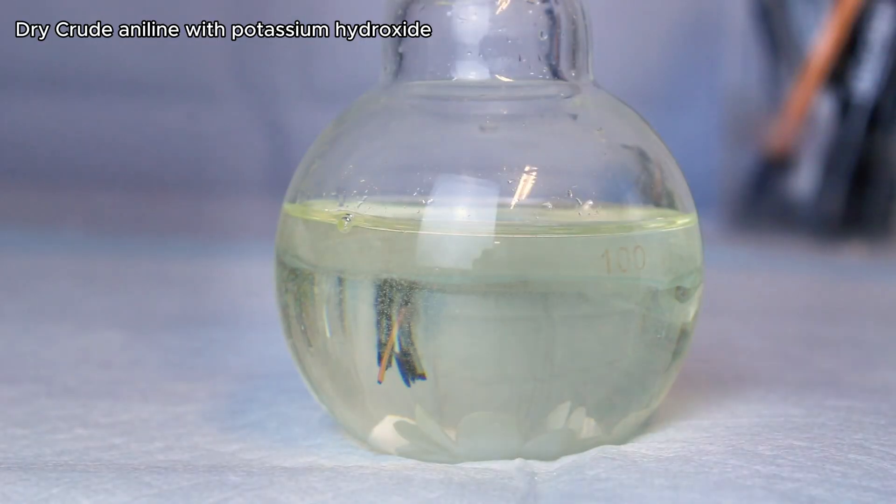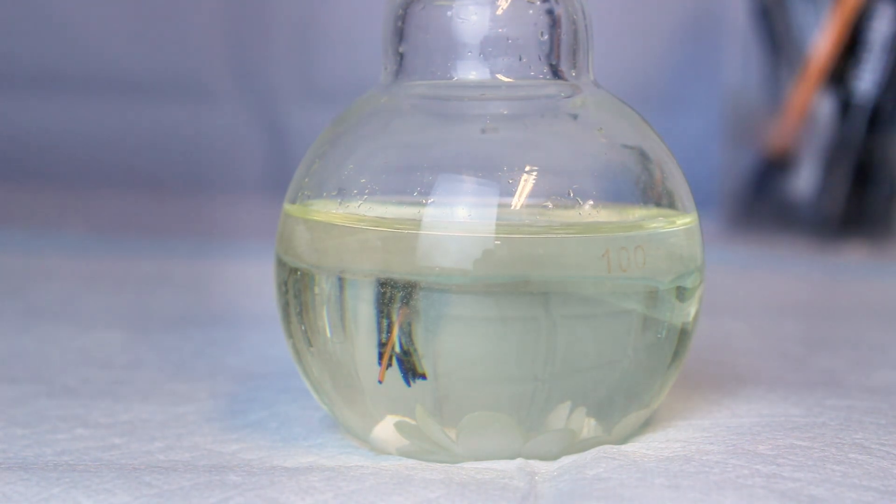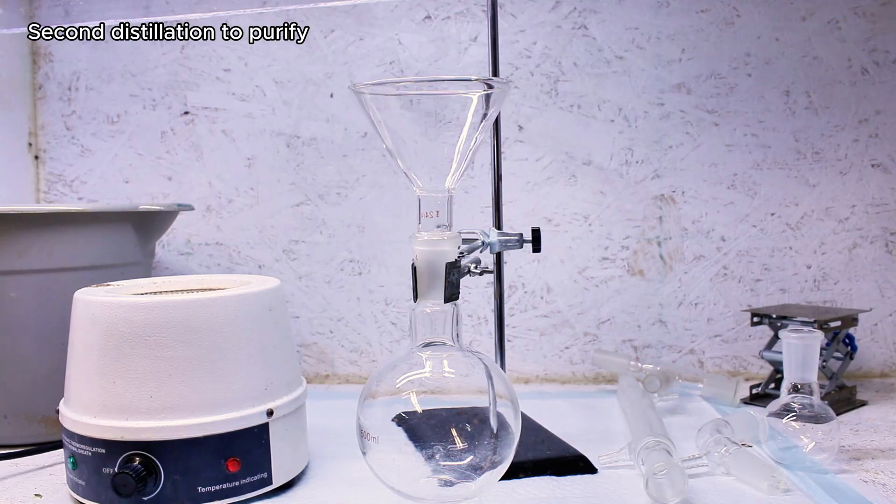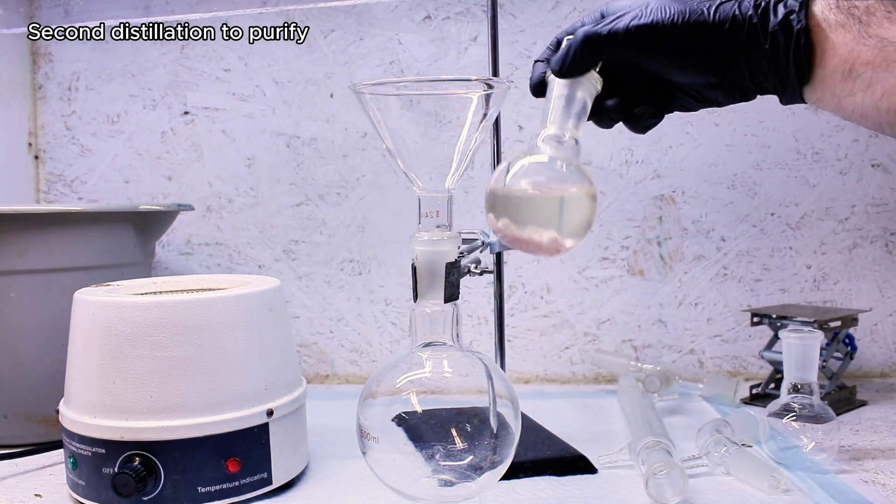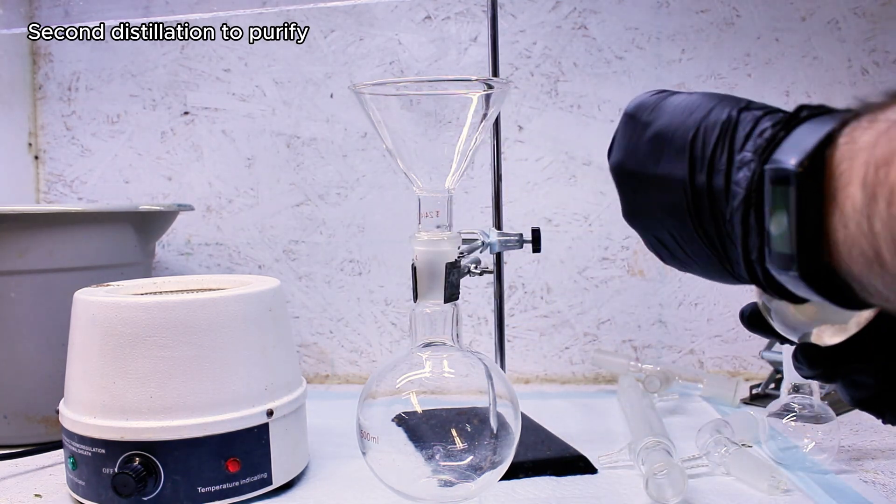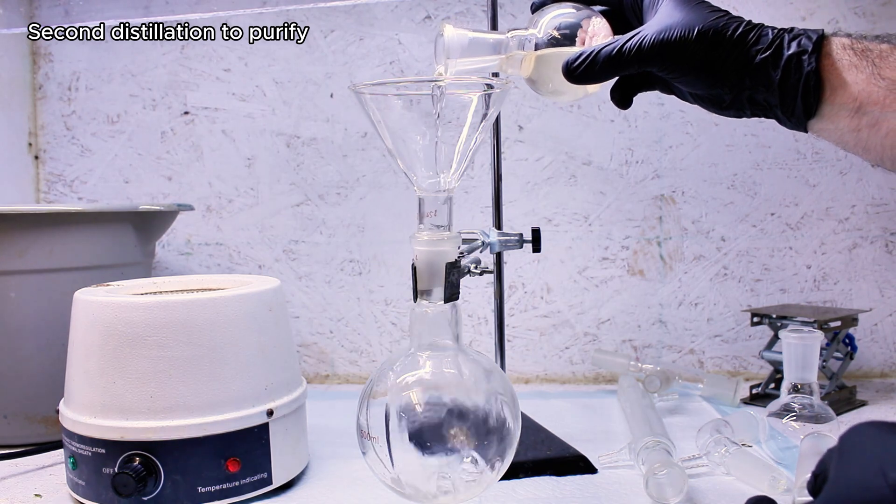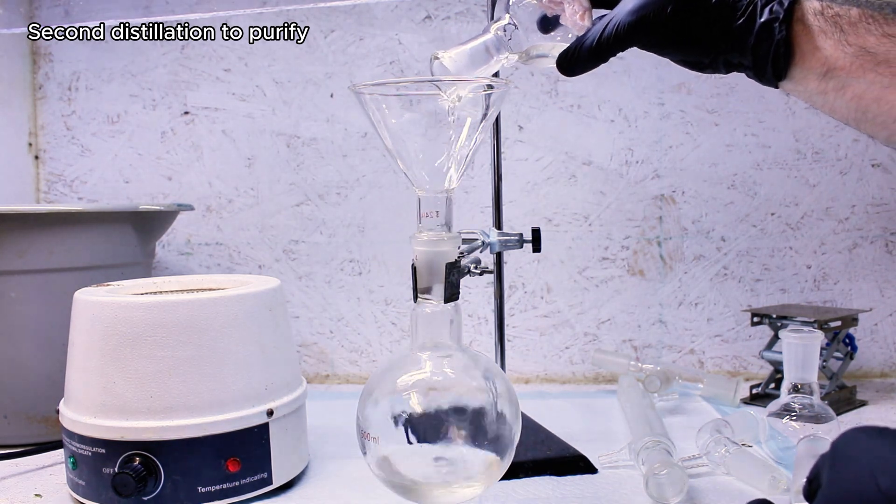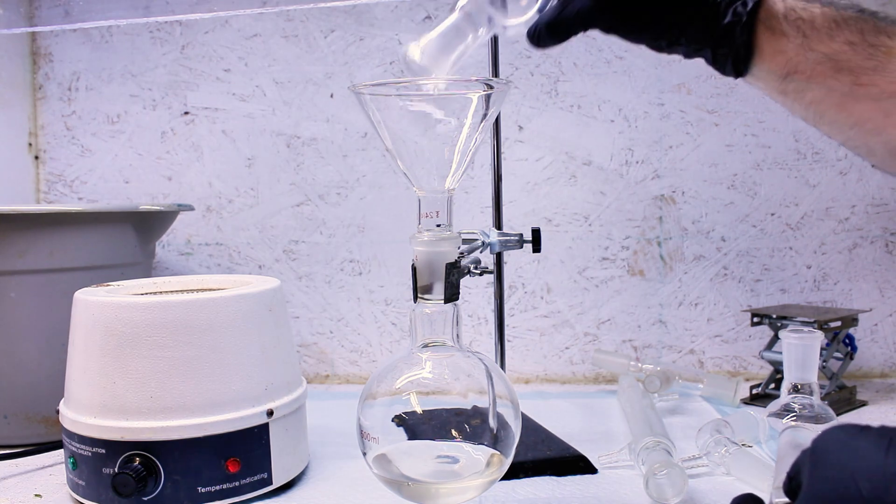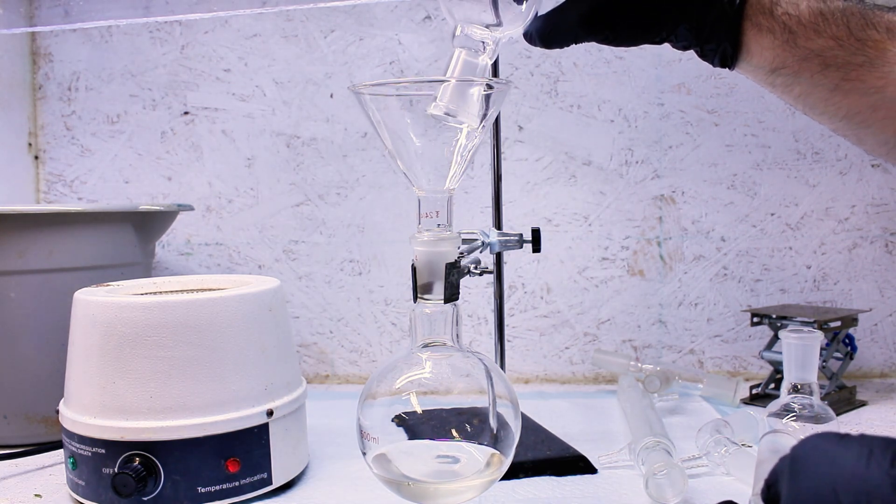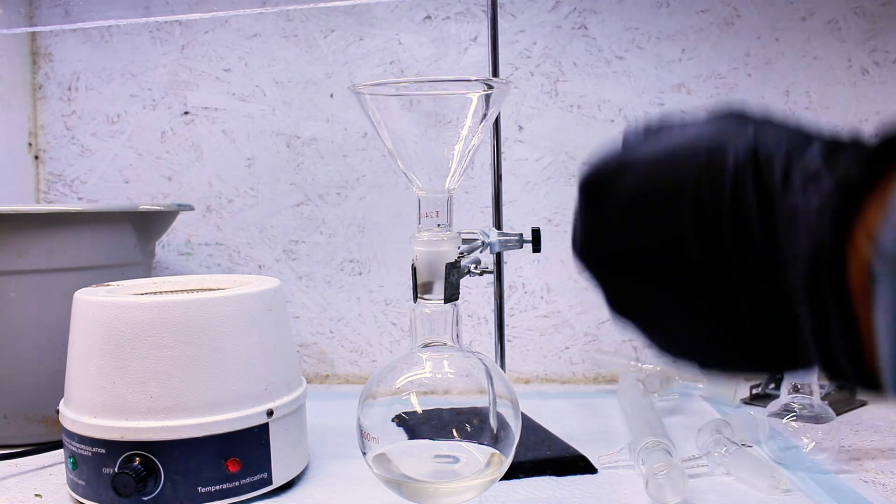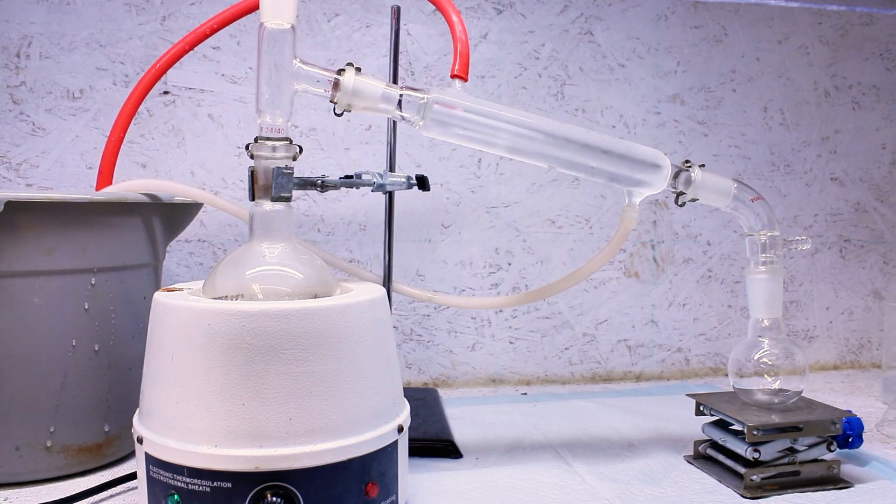When I come back to it the next day, the now much drier aniline is added back to a new boiling flask and set up for another distillation. I crank my heating mantle all the way back up, and the point of this step is to try to further purify my crude aniline by redistillation. Ideally during this step you would only collect distillate between 180 and 190 degrees celsius, but I was using my only thermometer for a different project so I didn't really bother.